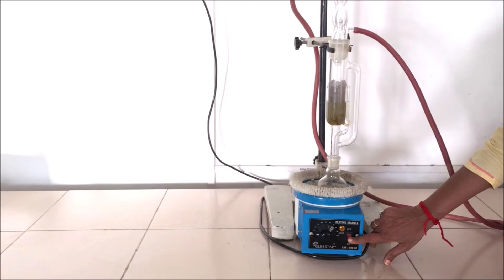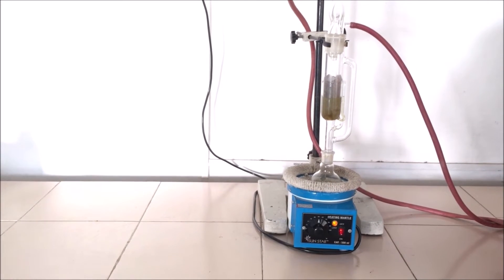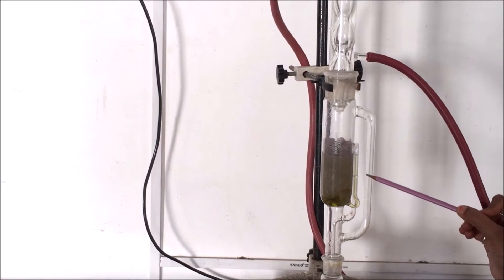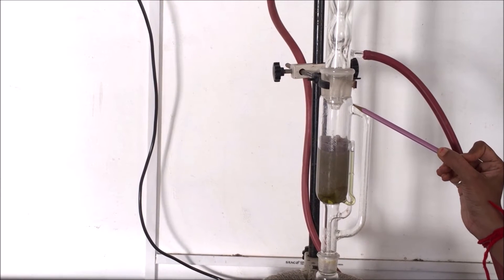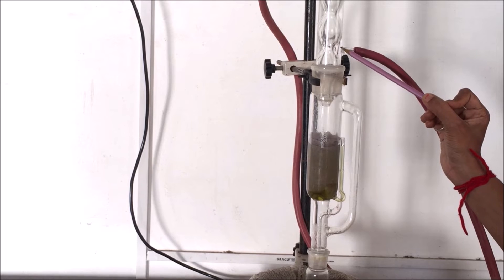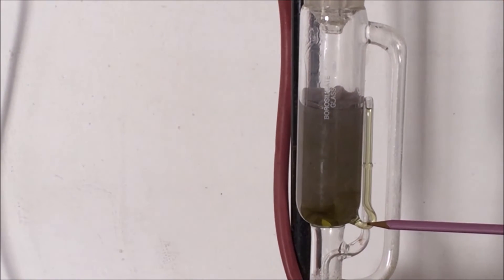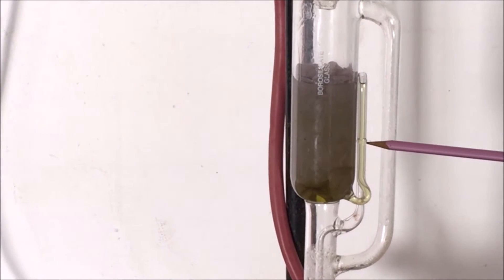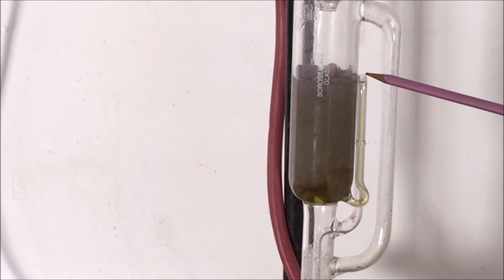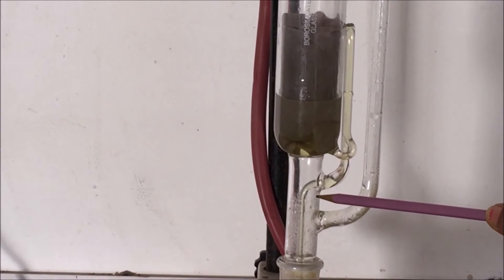Now switch on the heating mantle and set the temperature to the boiling point of the solvent. Gradually the temperature of the solvent increases inside the round bottom flask, and when it reaches the boiling point the solvent starts to boil. The solvent vapor passes through the vapor tube and rises up towards the condenser. At the condenser, the vapor cools and condenses to liquid, falling drop by drop into the thimble containing the drug material. The solvent penetrates the drug material, dissolves and extracts the chemical constituents. Gradually the chamber fills up with solvent, and simultaneously the siphon tube also fills. When the liquid extract reaches the return point, the complete solvent in the extraction chamber returns back into the round bottom flask through the siphon tube.